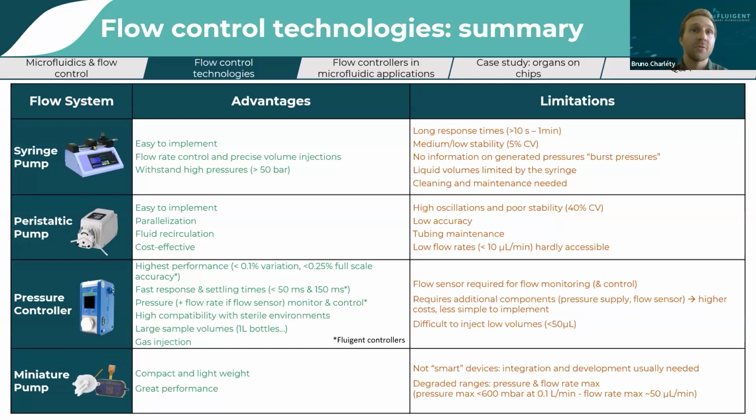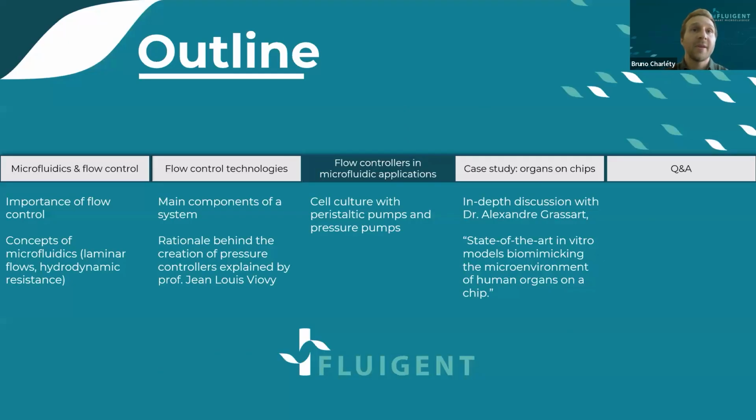It's also worth mentioning the miniature pumps that are quite emerging technologies. They are compact, lightweight, with great performance, but I would not qualify them as smart devices compared to the previous technologies, as they need further integration and development. Of course, the performance is also degraded. So now that you have a basic understanding of the different liquid controllers and that we are all on the same page, let's see how they perform on a typical microfluidic application.